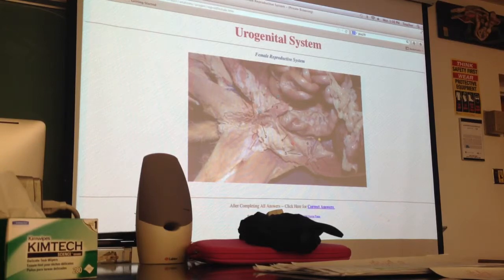I'll show you the bladder if you're not really sure what a balloon-like one looks like, because one of my cats is a little bit blown up, but this is also what another bladder would look like. Okay? If you're not really sure where the bladder is, a good way to find it is once you find the kidney, you can just follow the ureter down. Note that the ureter is going to look like it's covered in fat. That's okay. There's usually a lot of fat tissue on the bottom of the cat around the kidneys, for protection, since the kidneys are so exposed from the back.